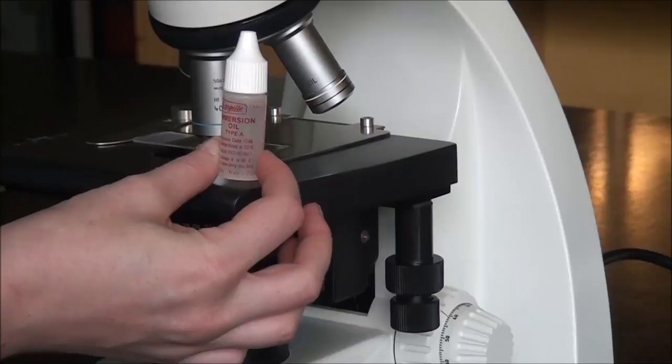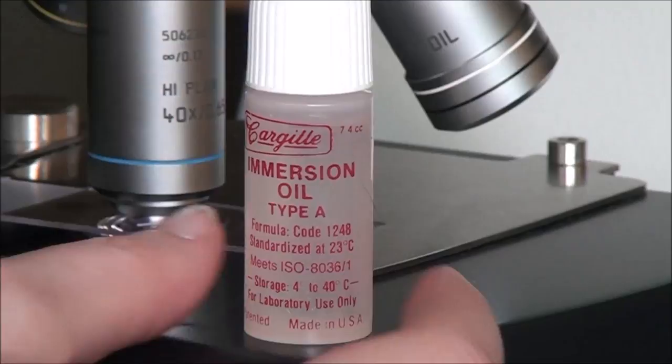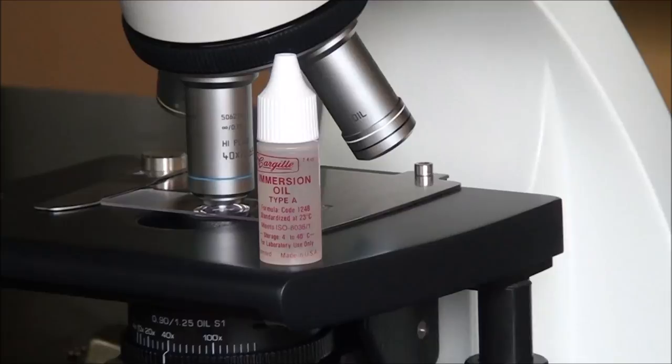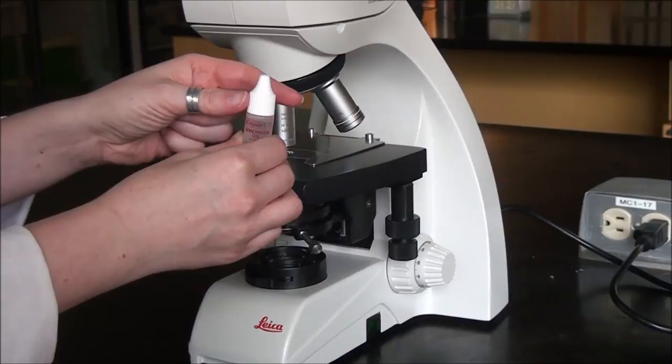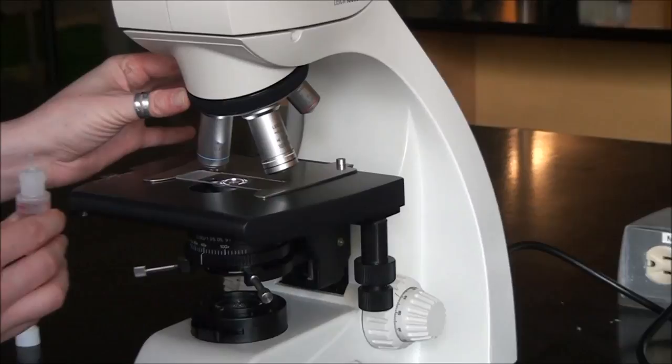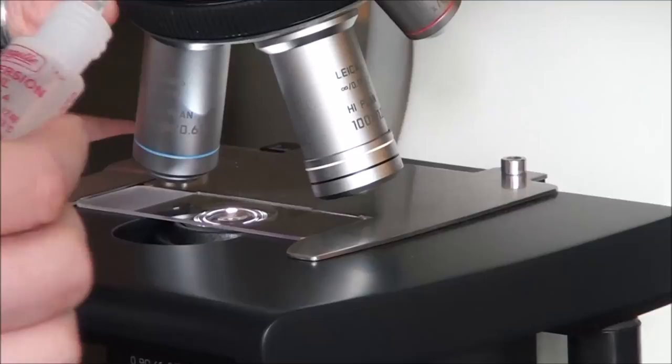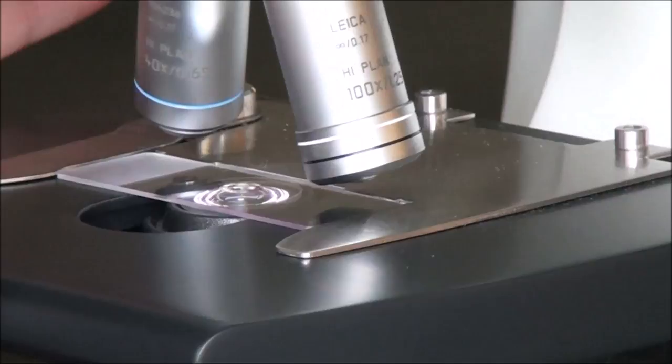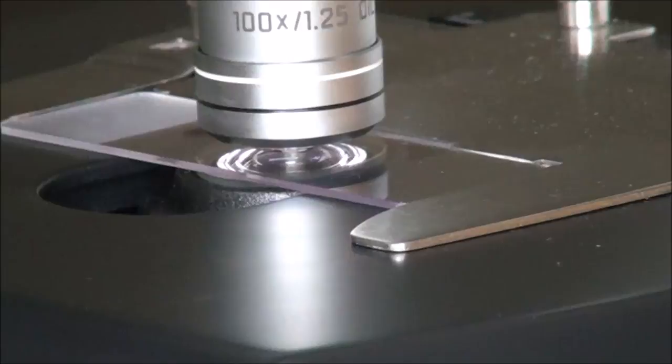Immersion oil is only ever used for the 100x objective lens. If oil gets on any other part of the microscope or any other lens that's not prepared for it, they're not sealed properly and the oil will wreck those lenses. To add the oil, which is necessary to reduce light refraction, I'm going to move the turret so that it is between the 40 and the 100 lens. Using our oil, you're going to add a single drop of oil over top of that bright little spot of light—just a drop is all you need. Then we are going to slide that 100x lens into place and it will contact the oil.